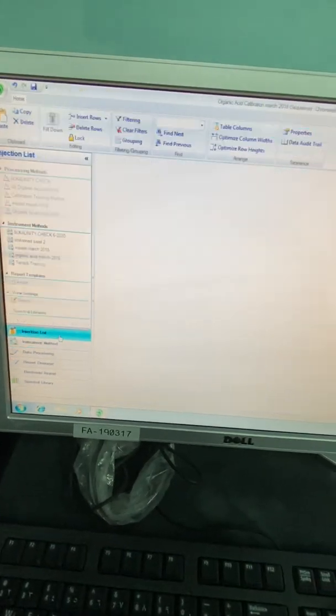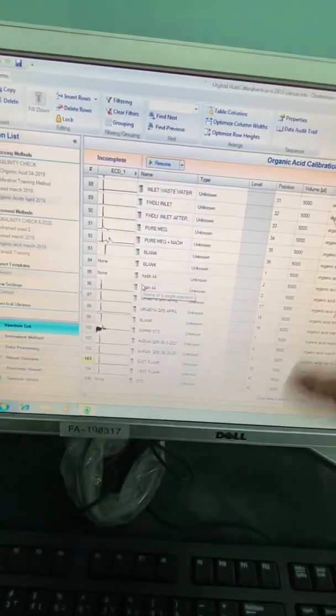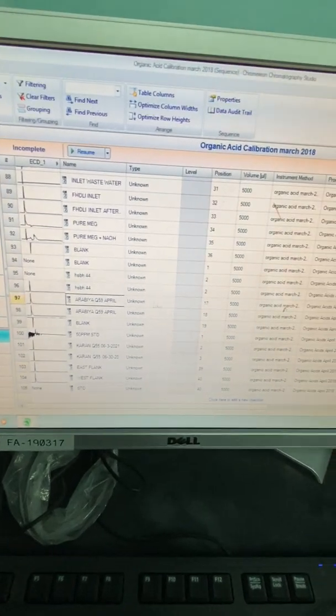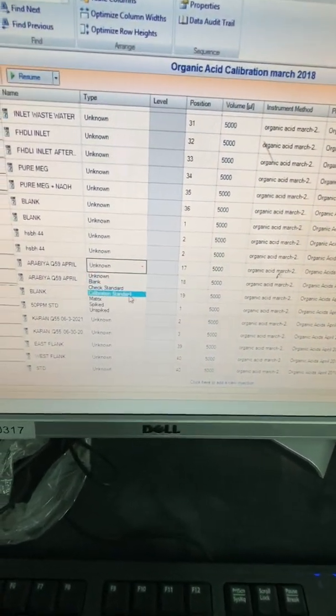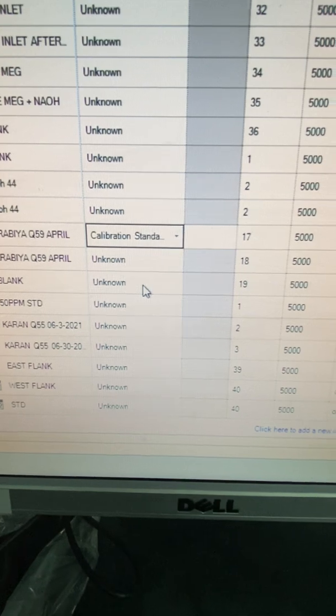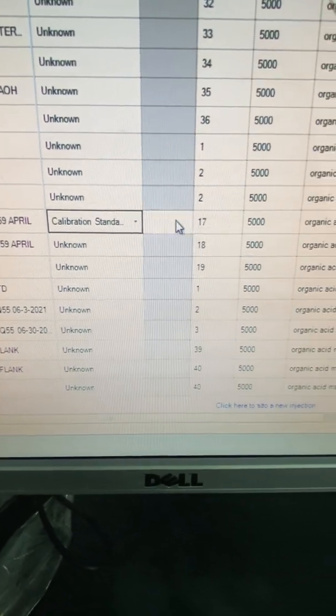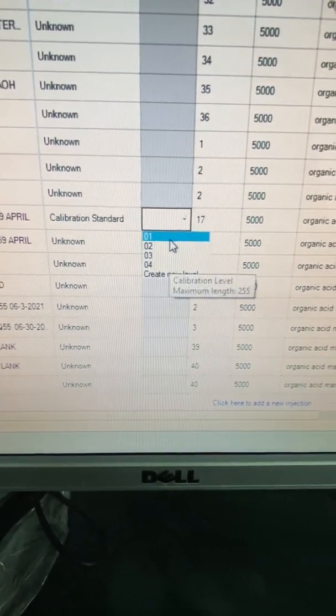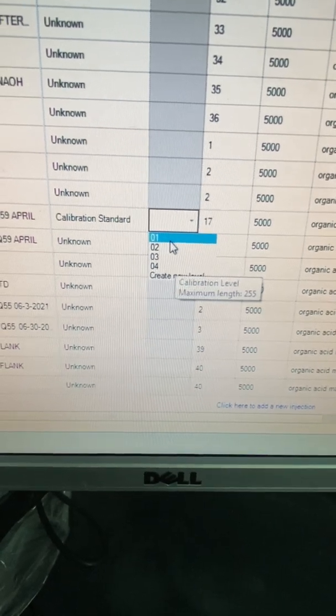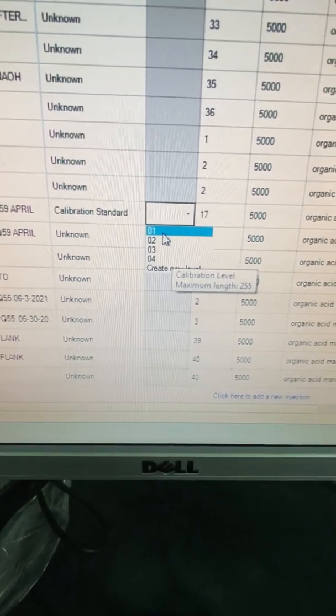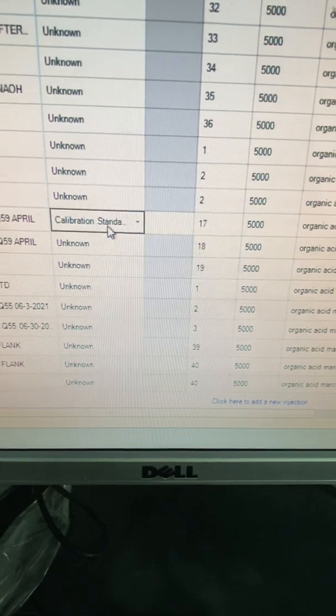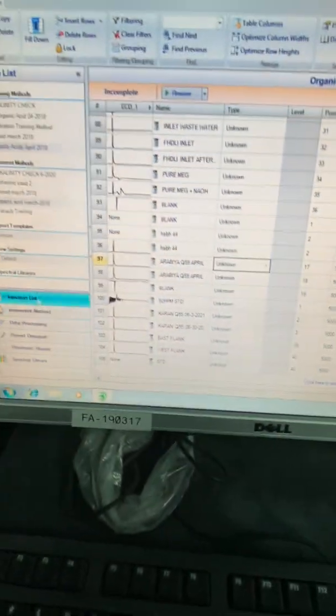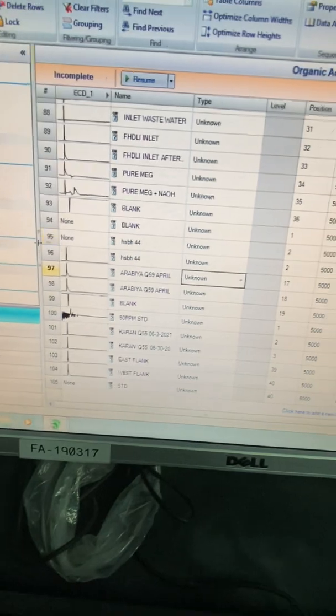Now, from the injection list, I already named my processing method. So, for this one, I will consider it as, once you press calibration standard, you will see this one will be active. And ask you which level you want. In the beginning, it will be like calibration level one. And then it will be two and three. You will add them all. But now it's unknown.